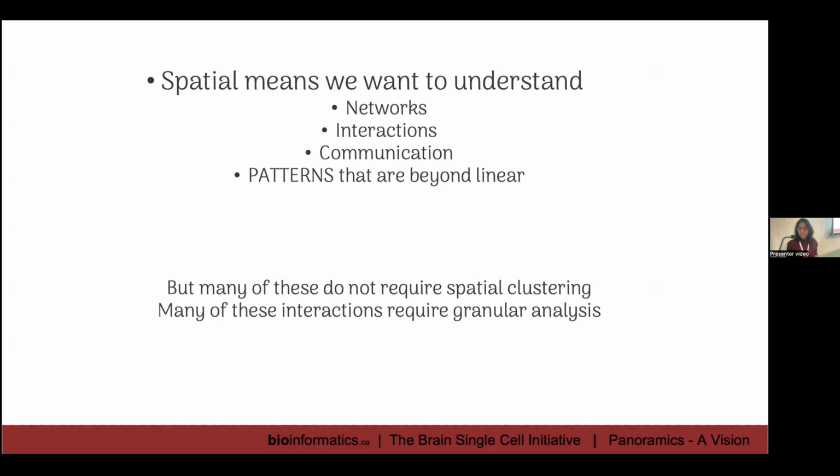But the reason I emphasize looking at your materials and methods, and at the results, is that many of these are actually smoothing algorithms. They're trying to find common patterns and group them for you. So how do we know that in a diseased or treated state, the domain I'm seeing is actually factual?